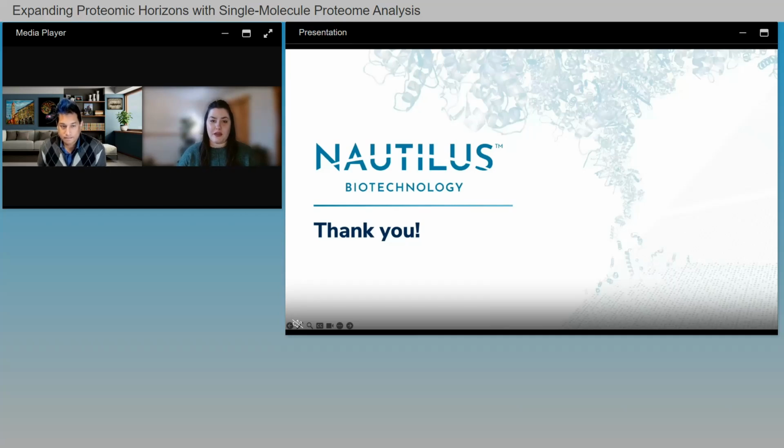Excellent, thank you. All right, our next question here, we have time for just a couple more. So our next one asks, how do you remove high affinity antibodies after each cycle? Fortunately, our proteins are glued down to the surface, effectively through the nanoparticle. And so we can be incredibly stringent with the buffers that we use for removing bound antibodies, including incredibly high affinity antibodies like the tau antibodies.